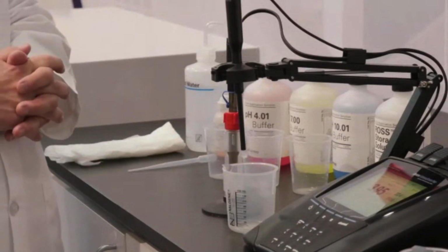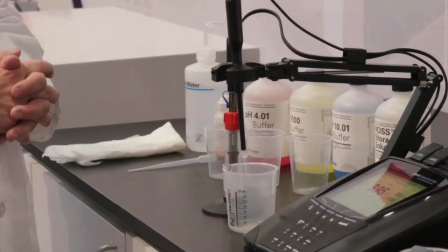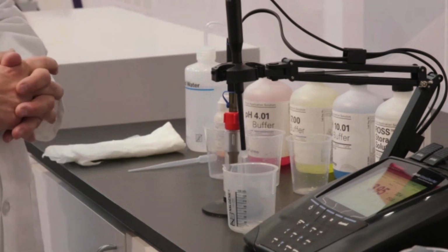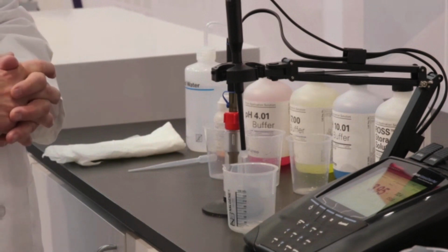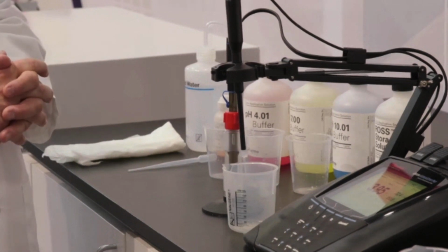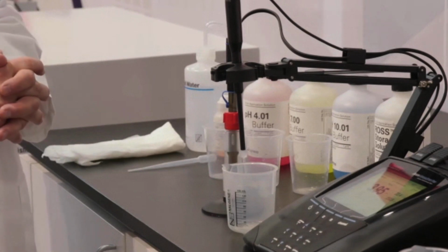An important thing to do is to discard any used buffer that we might have in the work area. A fresh pour of buffer is needed each day. We cannot use yesterday's buffer for today's calibration and get best results. So Steve, let's pour some fresh buffer today.